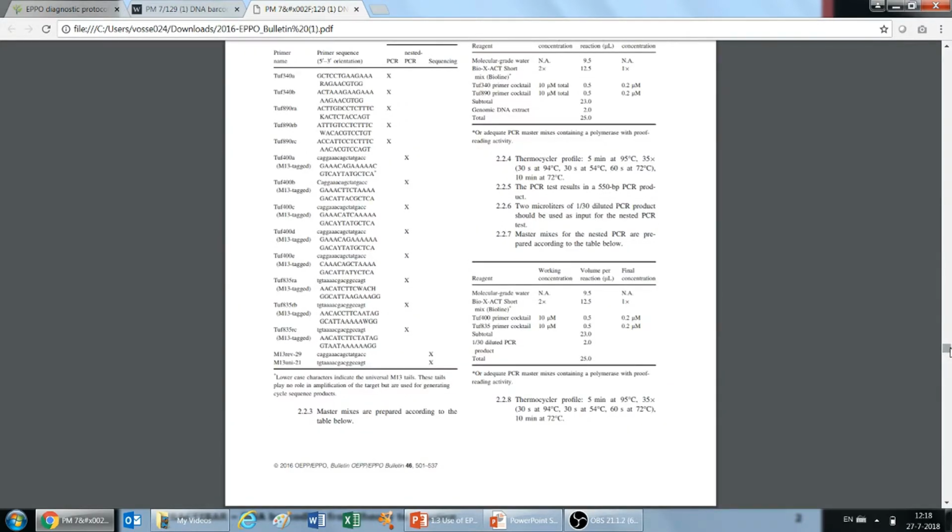So a question we get often is, why are there no DNA barcoding tests available for viruses? That has a simple explanation. Since these viruses are so diverse, we cannot design generic amplification primers that would serve as a kind of barcode that would be used in a barcode strategy. The guidance that we do provide on generating data, producing consensus sequences, and how to analyze your data using online databases also applies to viruses and viroids.